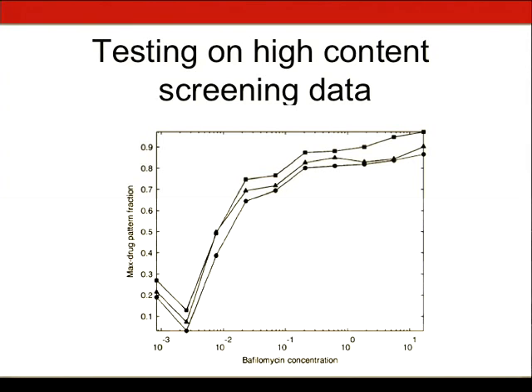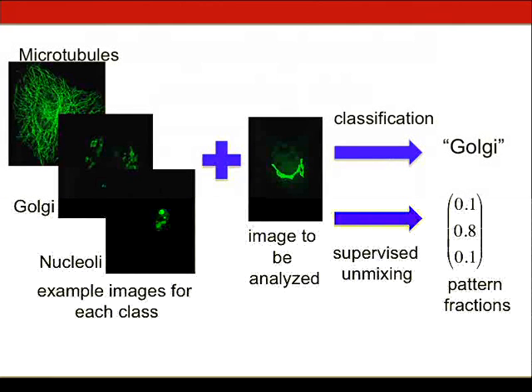Those are the three differences. A very good dose response curve from measuring the fraction of protein that's in the autophagosomes and not in the presence of this drug. So this represents an approach for that.